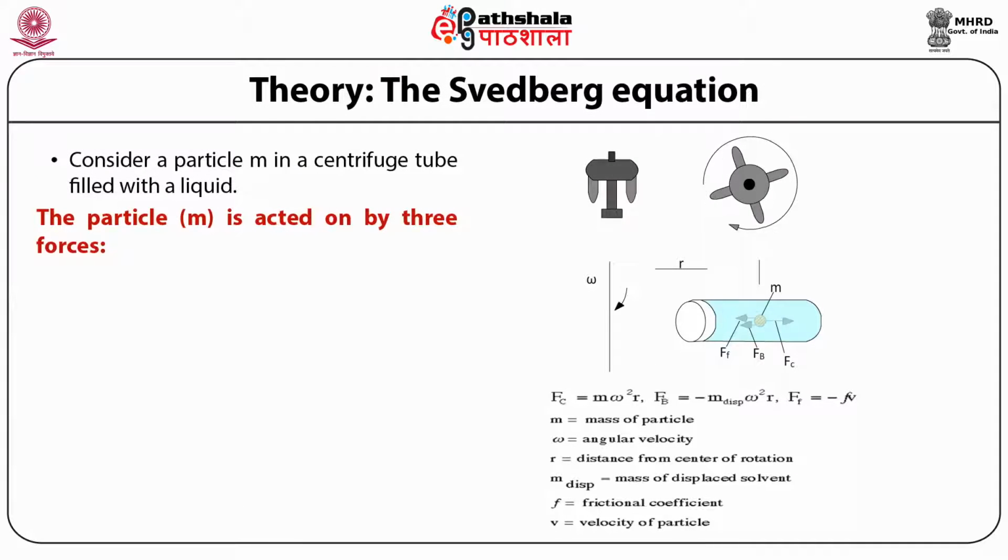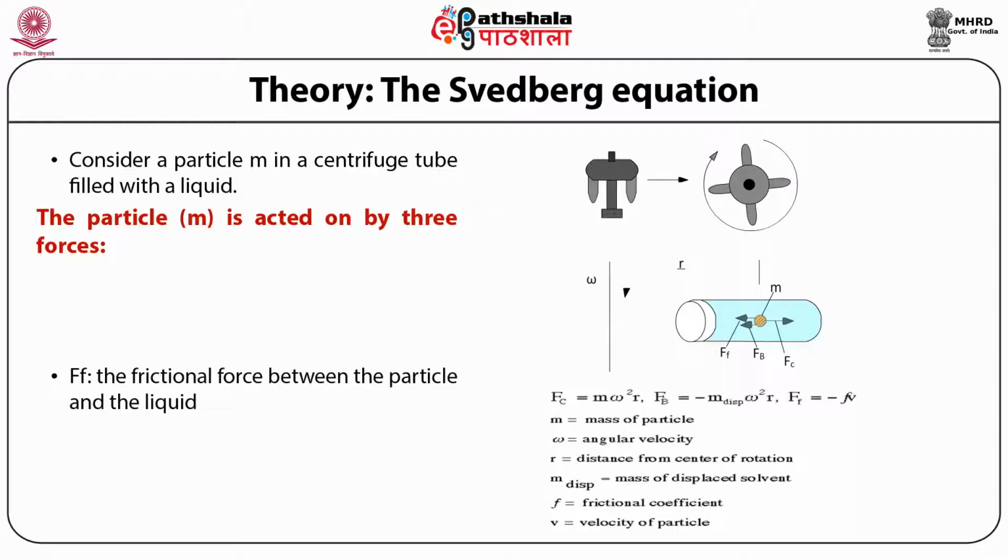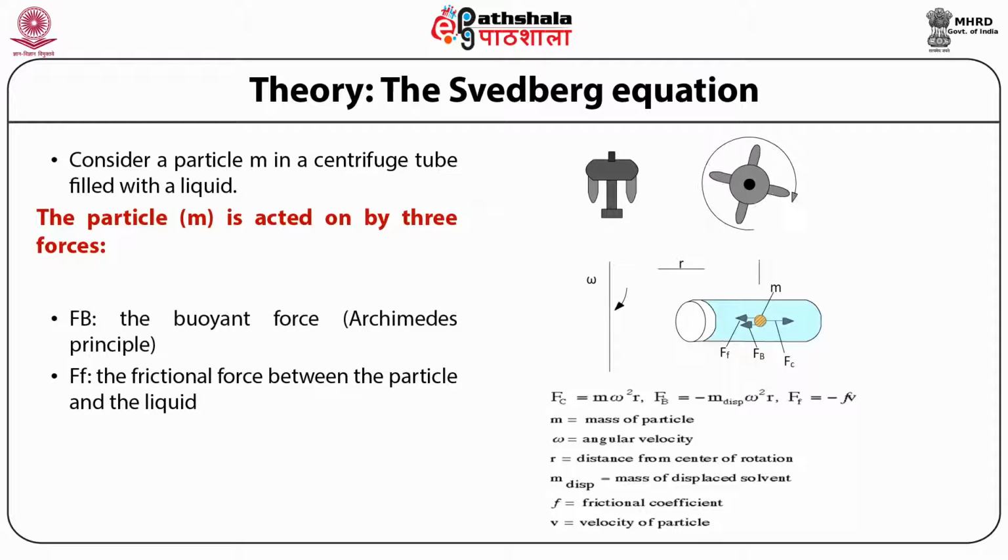You can see here that centrifugation techniques, and especially the ultracentrifugation technique, are based on the Svedberg equation. The Svedberg equation is a simple mathematical derivation of the centrifugal force. If you rotate a substance in a centrifuge, there are many forces acting on it. The first is the frictional force, then the buoyant force, and then the centrifugal force. So the centrifugal force equals the frictional force and the buoyant force.